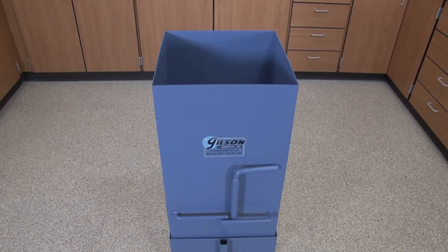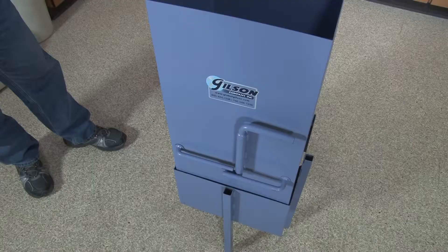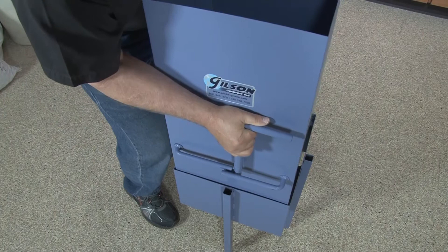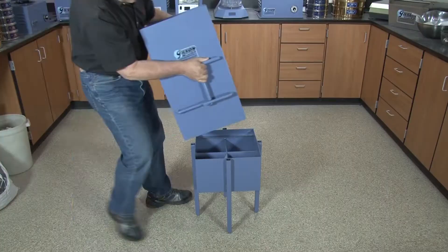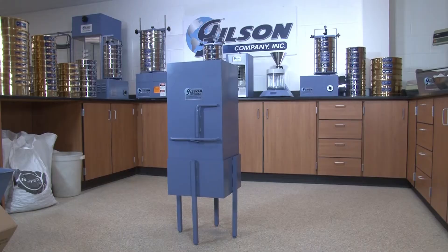This rugged steel constructed unit stands up to field conditions, and its upper and lower parts allow for easy portability between job sites and easy cleaning to prevent sample contamination on the splitting surfaces. The large gate-release hopper reduces handling of hot material during preparation.